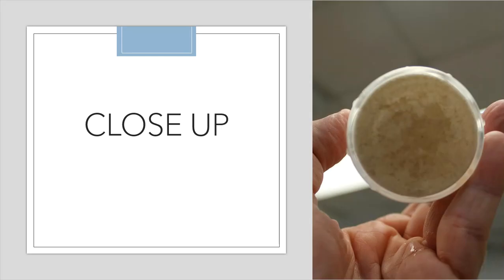From the bottom, that's what you see there. It almost looked brown here, but it wasn't brown. It was just so much of it that it prevented the light from going through, and it took on a different color. So I need to filter this again. Right, this is my recrystallized product.